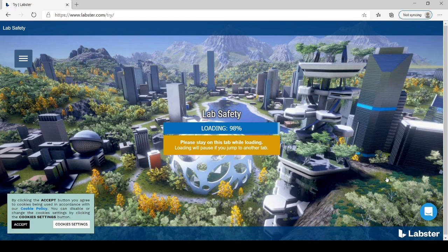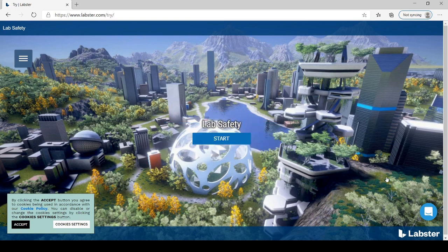So it is almost done. Now our lab will be ready and we will proceed with a small demonstration of a particular subject. And here the best thing that you can observe is that most of the time there is scenario-based learning through which we learn something or the other. So let's start with the lab.